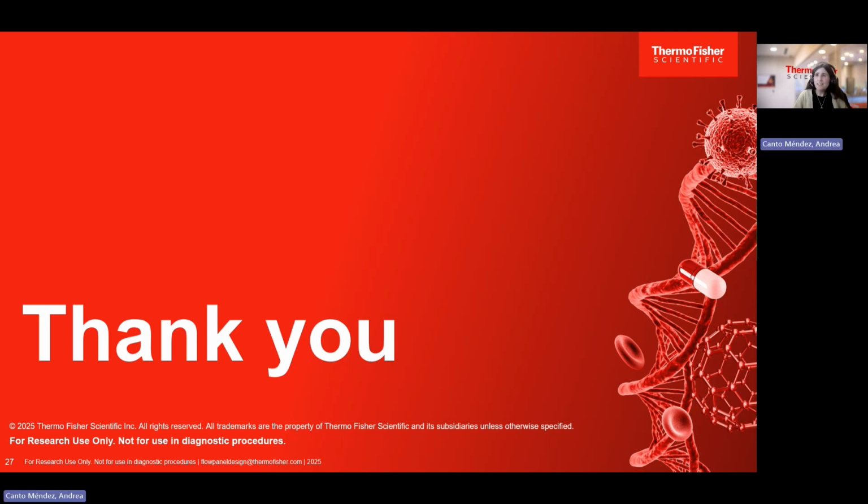Thank you. This is actually something quite interesting, and we could have a very long discussion about it because in the end it will be something very particular to a given experiment. Although when developing products we focus on mimicking the in vivo responses as much as possible, having the full activation profile and the full phenotype profile that a cell has in vivo, in vitro is sometimes just not possible.